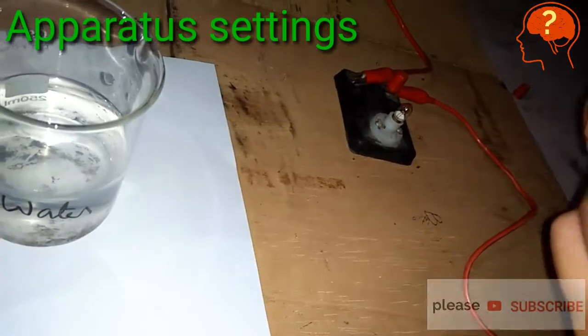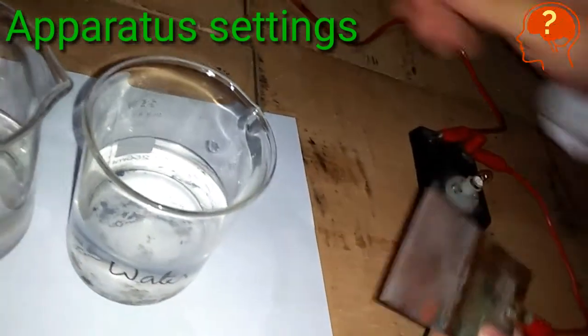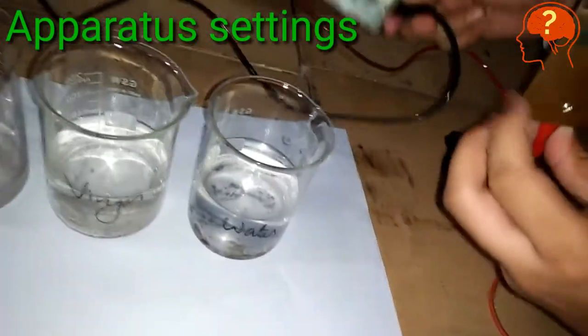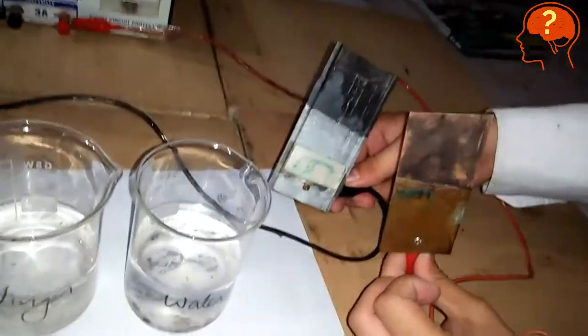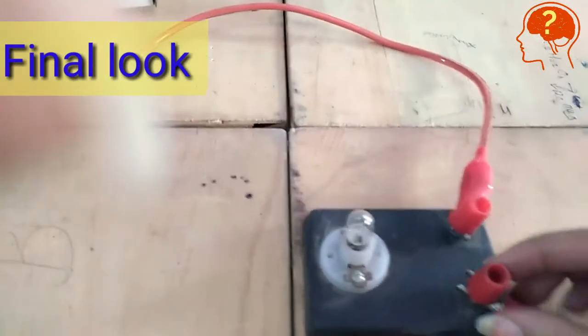Be careful while setting the apparatus. Here are the two electrodes. This is the final look of the apparatus — you can see the connections between the wires and the terminals of the battery and the bulb.